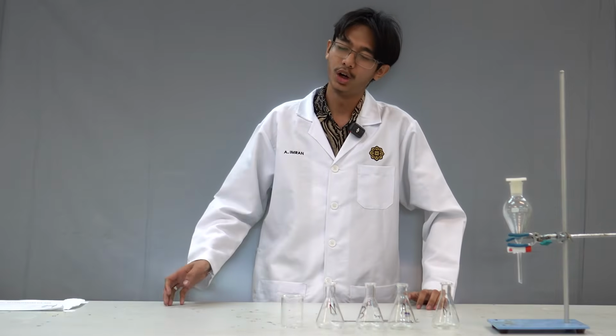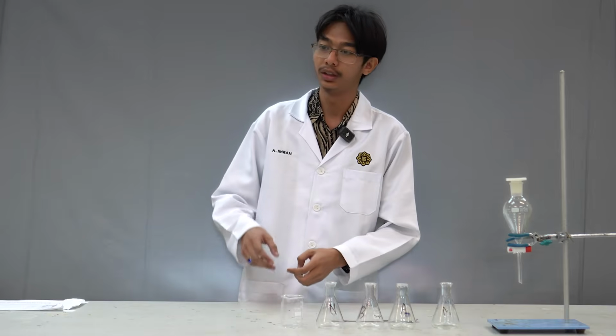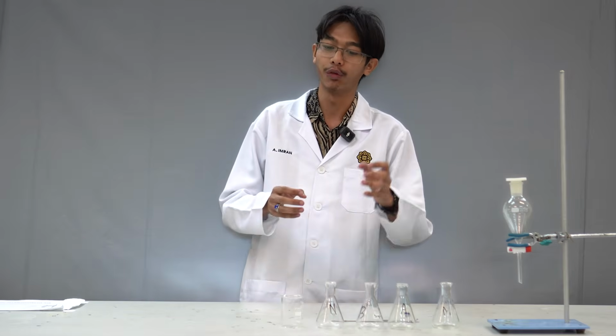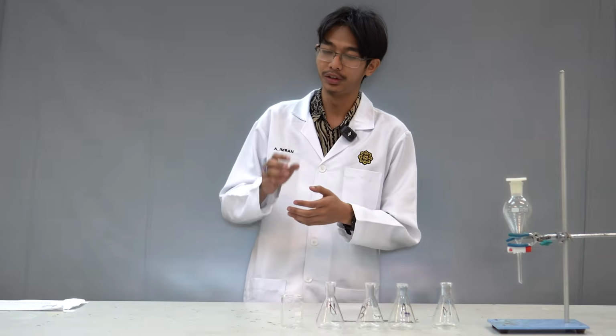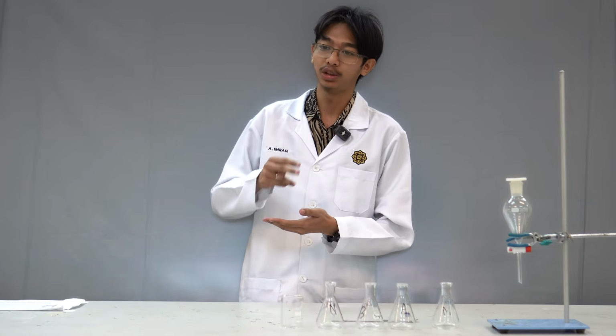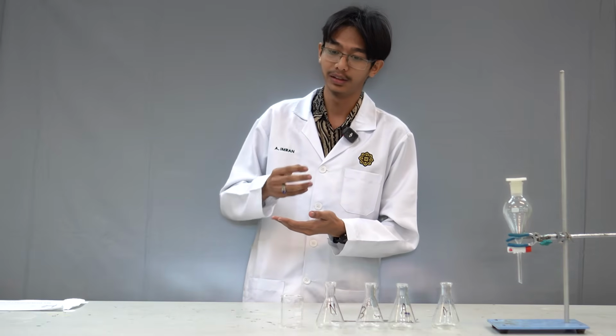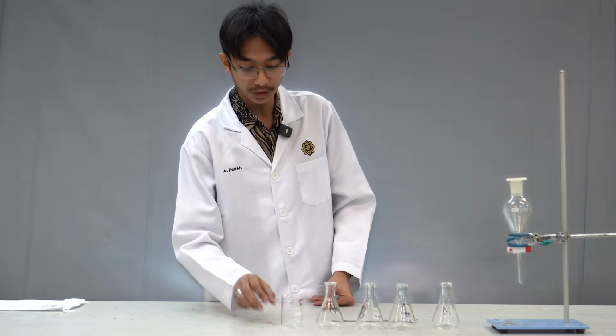Hello there. So I'll be presenting on two matters. First, how do we get the mixture in the first place? We are going to do liquid-liquid extraction, so of course we're going to have the liquid from which we're going to extract another liquid. How this is done will be explained by me further in my speech. And second, I'll be explaining how you extract acid from your liquid mixture. So let's start with my first point.